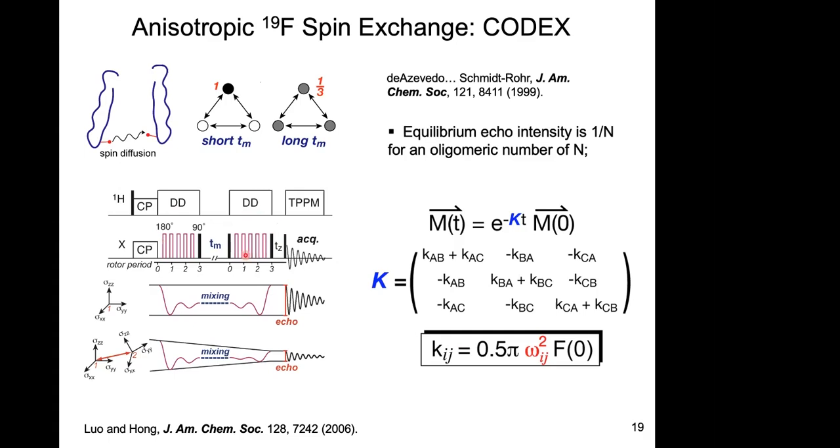And then you do the same pi pulse train again. The idea of the second pi pulse train is to basically unwind the effects of the first pi pulse train that recoupled the CSA. If during this mixing time nothing happens, meaning the molecule is not doing a slow reorientation, or the magnetization of one spin does not have a neighbor, another spin that's close enough, then the magnetization during this time won't change.